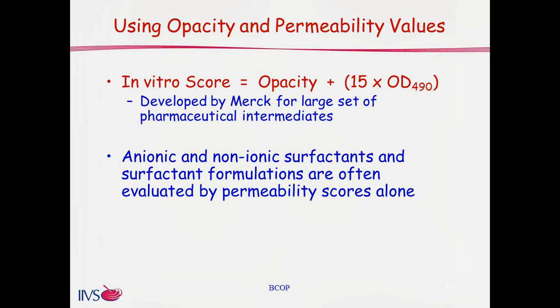So in each of these cases, the negative control data are used to correct the test material and positive control data to obtain the final positive control and test material results.